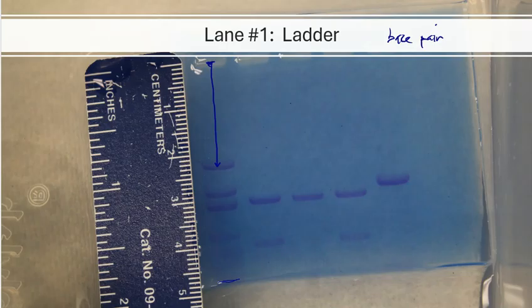So we need distances. That's what we need. So here is the distance for spot number 1. And if we go over, you can see my ruler, my centimeter ruler. And the only thing you've got to do is just record the number of centimeters. I'm going to let you make that decision. Record the number of centimeters that you see for band number 1.